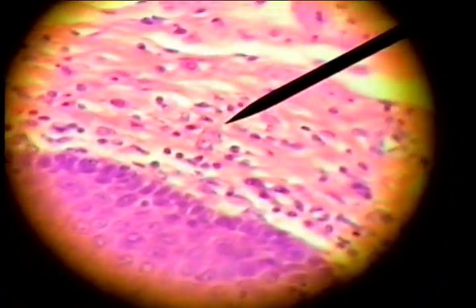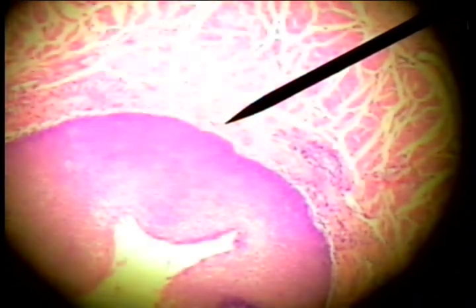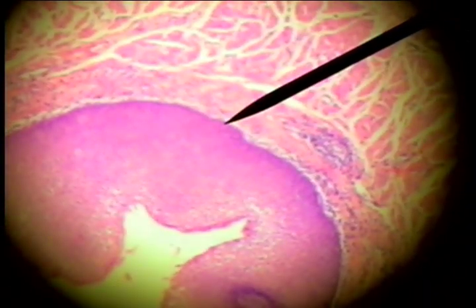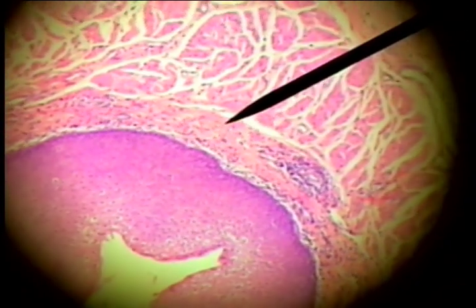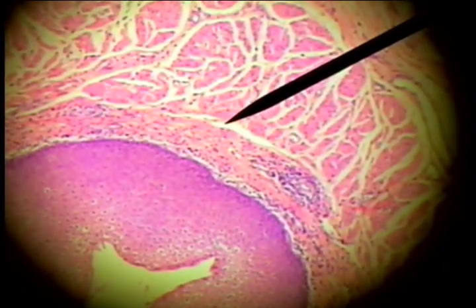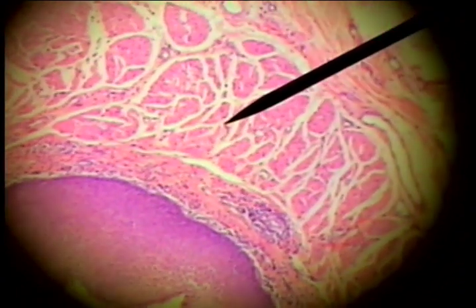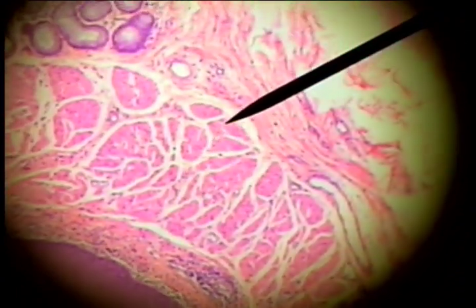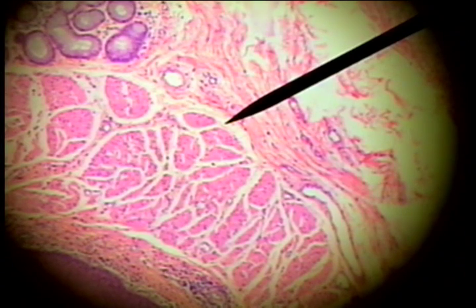Beneath the epithelium is a connective tissue layer called lamina propria — here's lamina propria from here to here. And then the third layer of the mucosa is the muscularis mucosa, composed of smooth muscle.